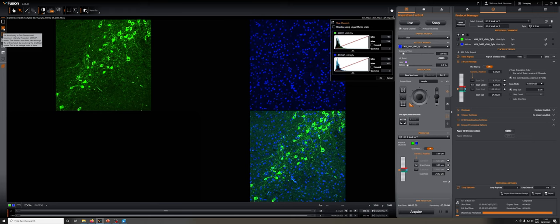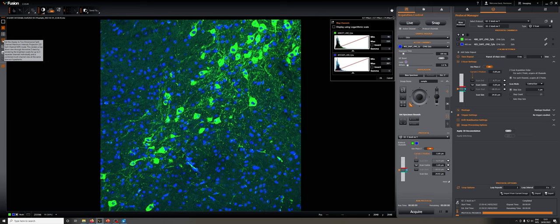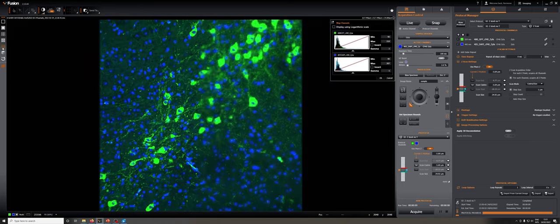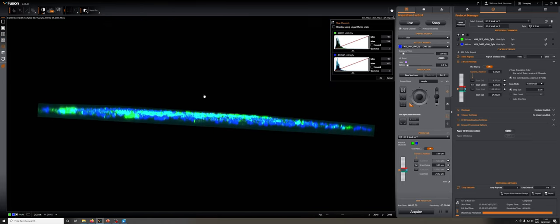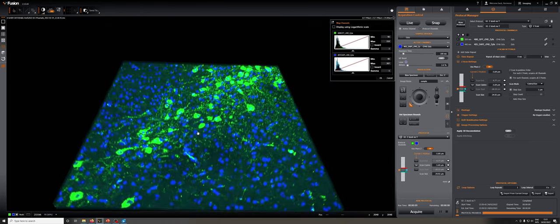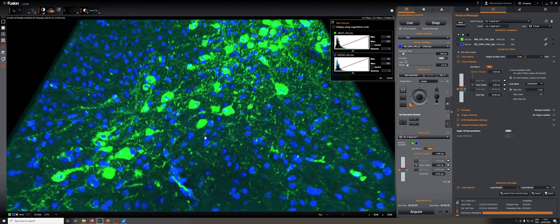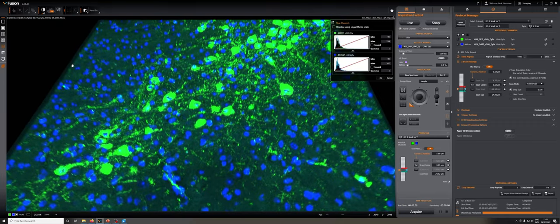This mode shows you the maximum intensity projection. You can see how this one is a combination of these two, so it uses the maximum intensity projection for each channel. This version shows you things in three dimensions. This is arguably not very three-dimensional, but you can look at this, and you can do all these things live.